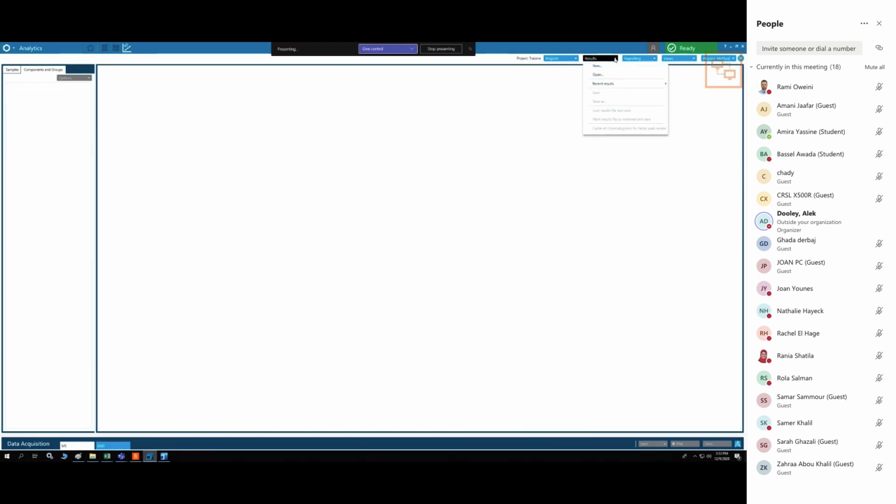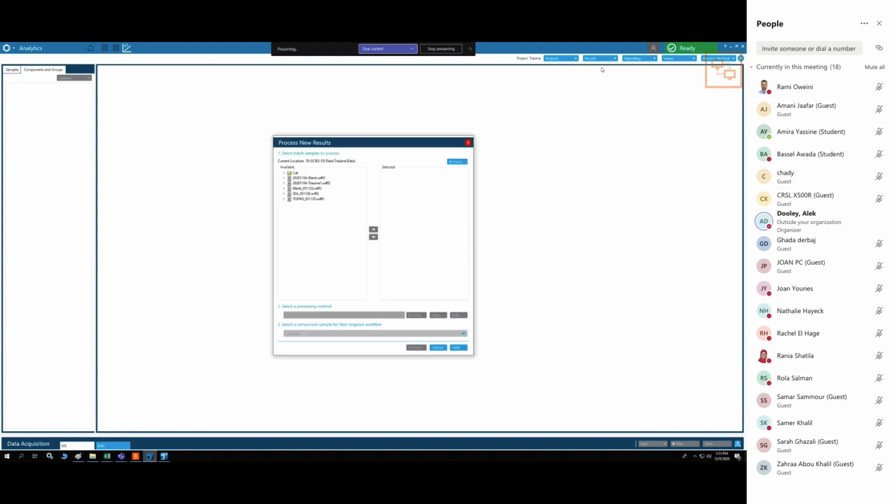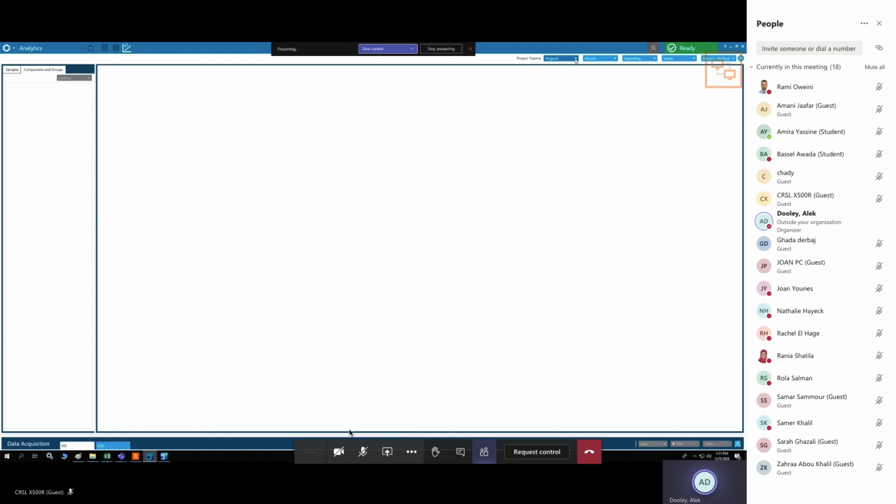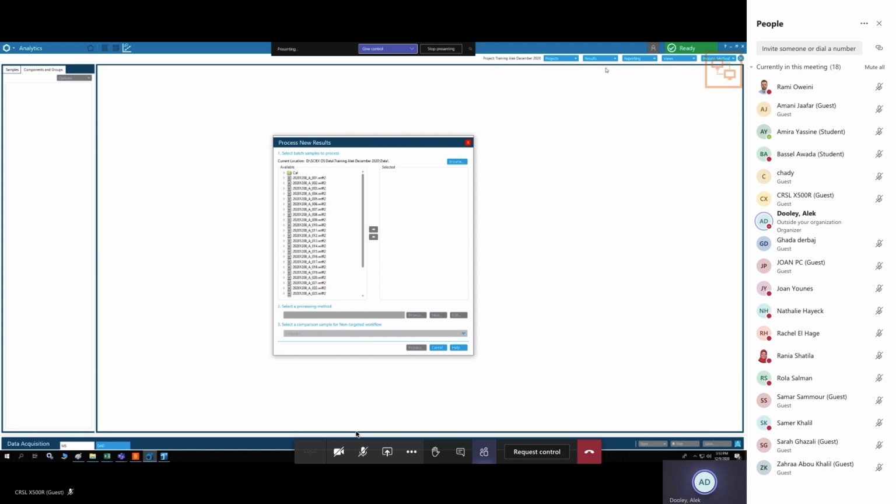Alrighty, so let's see here now. We'll go to new results, right? And we'll find the data that we ran yesterday. So where is that? We're in the wrong project, right? So this is not the right project. That's good that I did that. We can also change the project from here. So Triad Training is the right project. Now we'll go to results and we'll go to new. Right, here's our data. Okay, so here's a question for you. Can we use the processing method we just made for this data we ran last night?